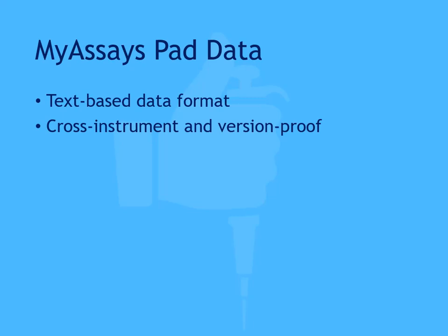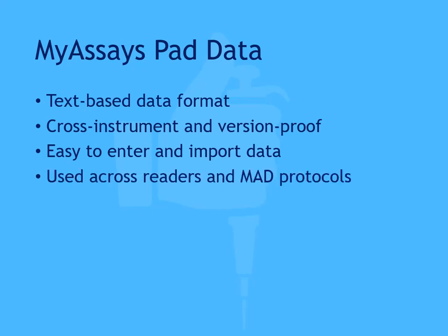This pad format provides an easy method for entering and importing data and is available through all MyAssays desktop protocols in MyAssays Analysis, as well as through the new protocol wizard. The consistency of this format allows data to be used across readers and in all MyAssays desktop protocols.